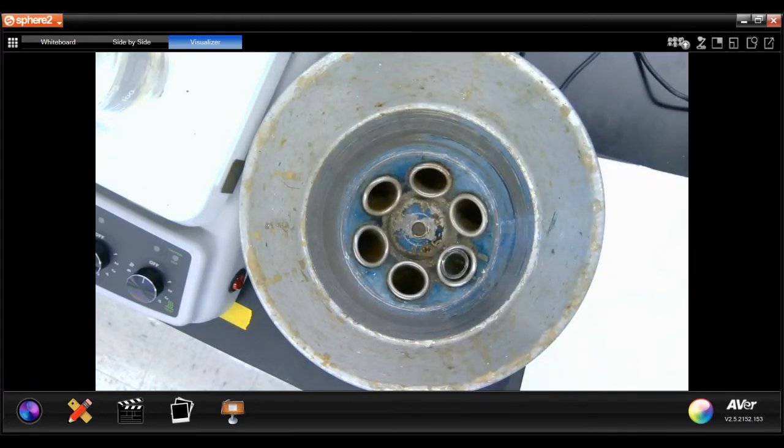I'm going to take the precipitant and wash it with a mixture of 10 drops of sodium hydroxide and 10 drops of water.